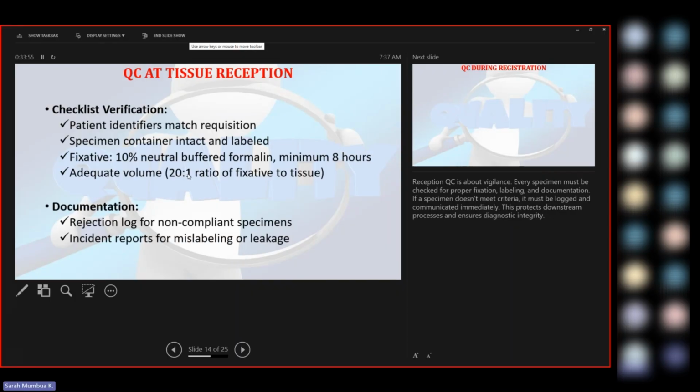And as I said, in this aspect, you cannot reject a tissue for histology and say, now this one is because it's not well fixed or it's not well documented, throw it out. Some of these specimens you cannot rebiopsy. Maybe someone has had a mastectomy, they have removed the whole breast. If you say it is not well preserved, it's not well documented, and you throw it, where else are we going to get another specimen? So as much as you're rejecting that sample, you cannot discard it.